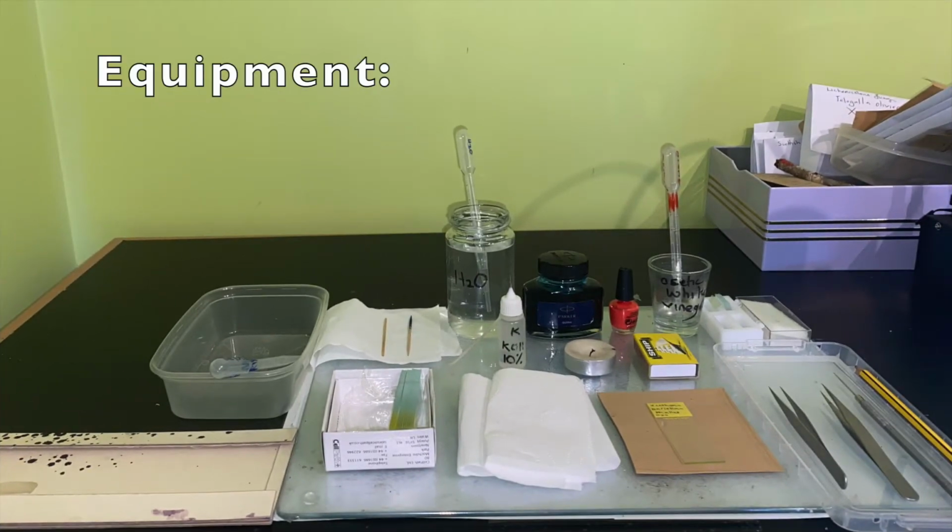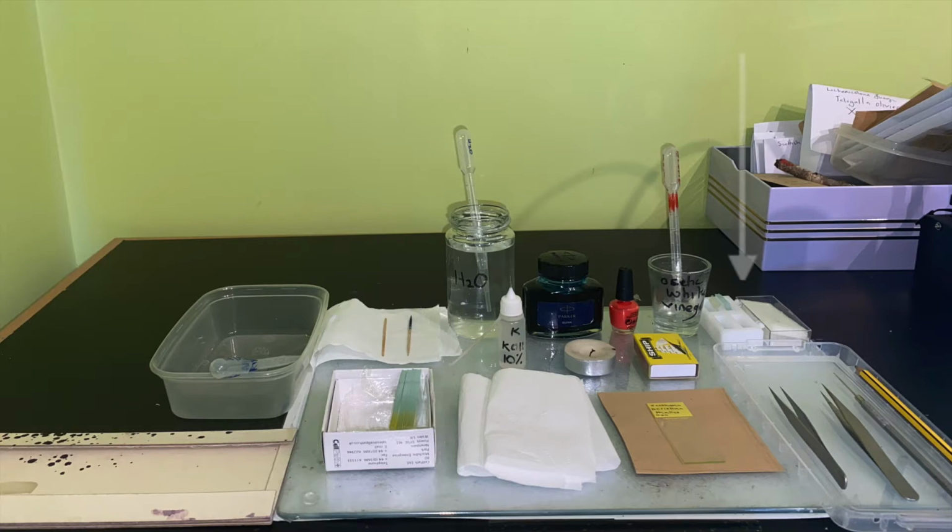Apart from the dissecting microscope stage, from where you have cut the sections of the lichen, this picture shows the kit required for the process. This comprises the following: glass slides, cover slips, pencil with a rubber end, ink (Parker's blue-black ink is recommended), acetic acid, white vinegar, a bottle of K, that is potassium hydroxide or sodium hydroxide, approximately 10% solution. This is the bottle you will be using for chemical tests on lichens from your kit. Tea lights and matches, fine forceps, cocktail sticks, a tray to put instruments in, tissue paper, a plastic pipette for water, and nail varnish.